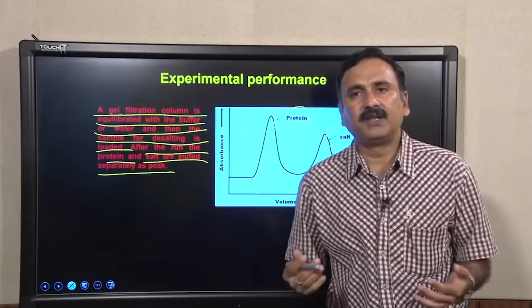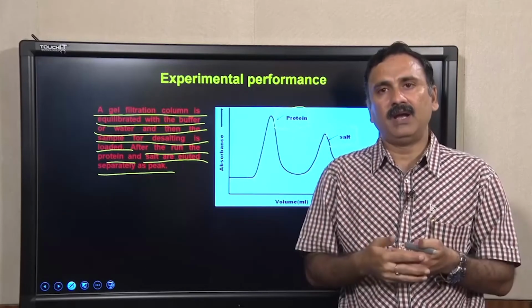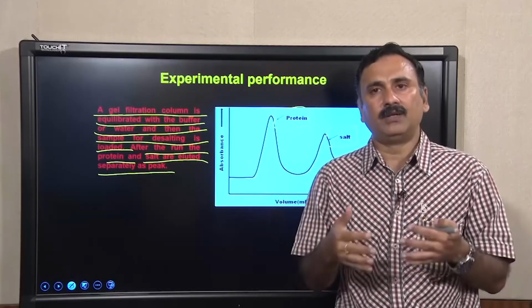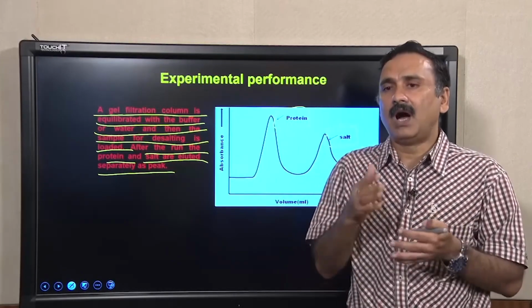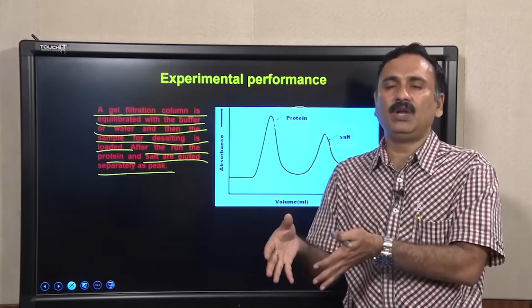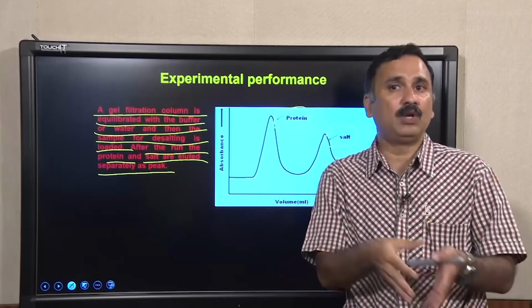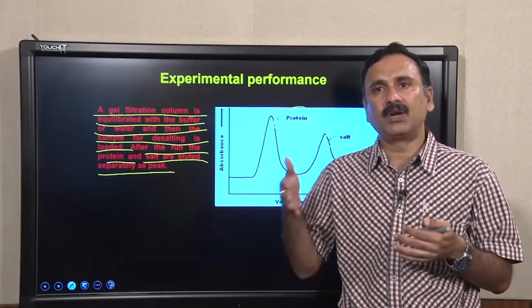We have prepared a small movie clip with the NAP10 desalting column, and with the help of this demo, you will be able to understand more nicely how to perform the desalting of a protein sample, whether it contains ammonium sulphate or other kinds of small molecules, and how you can get rid of them.